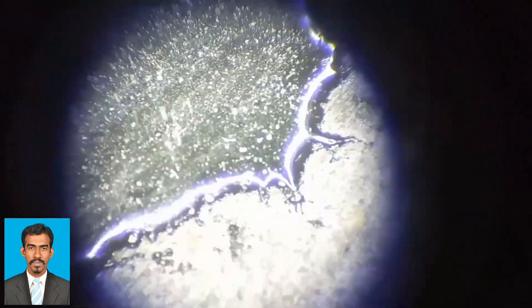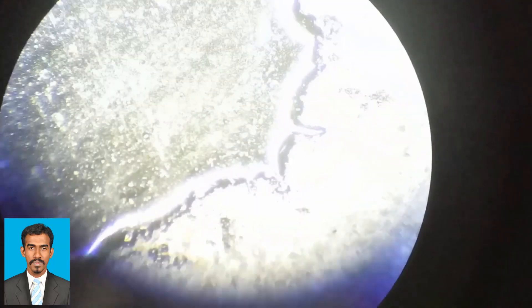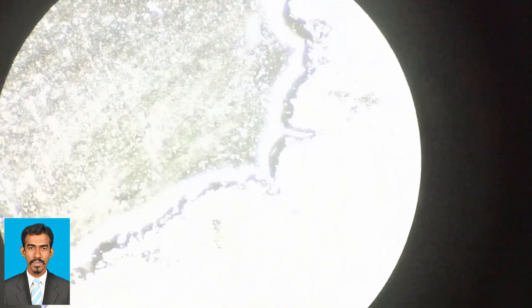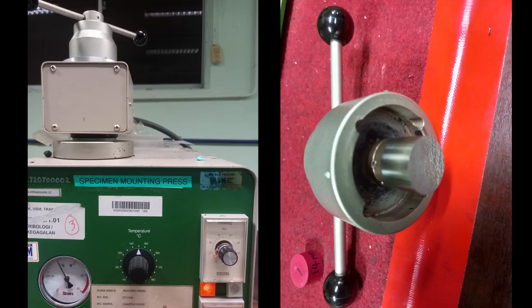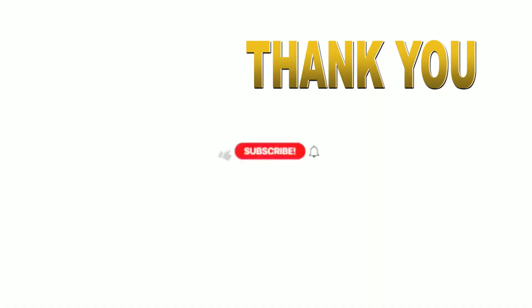Once the sample is produced, we can observe it through the microscope, because edge retention is an important consideration when selecting a mounting resin and hot press. Hot mounting compounds tend to provide better edge retention compared to cold mounting resins. In these microscopic images, you can see the clear edge of the sample as well as the mounting resin. After you remove the sample, switch off the machine and end the practical.